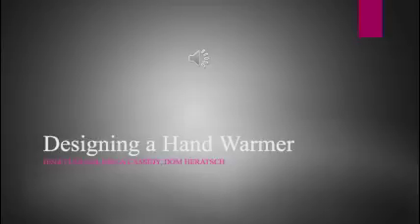And today we're going to discuss how to design a hand warmer using the Flynn Lab. In this Flynn Lab, we wanted to investigate the energy change accompanying the formation of solutions for common laboratory salts, and then apply the results to design a hand warmer that is reliable, safe, and inexpensive.